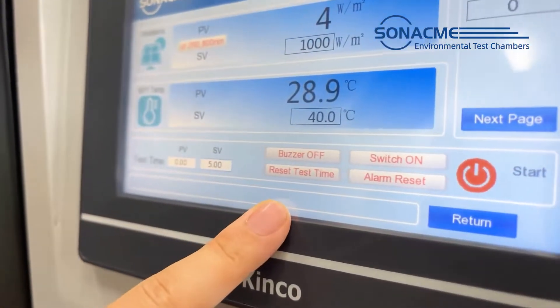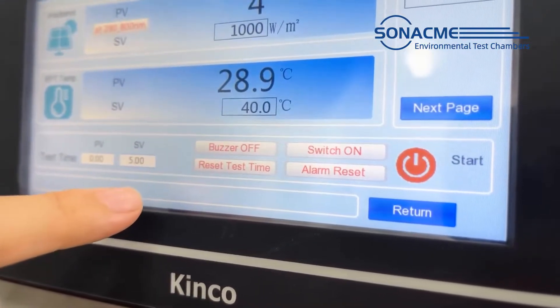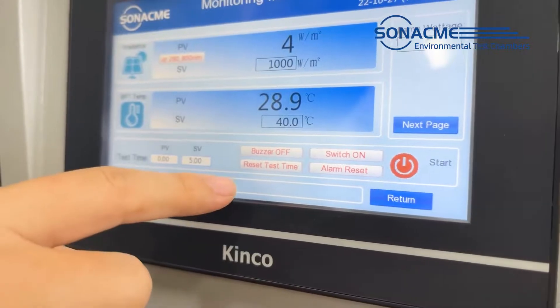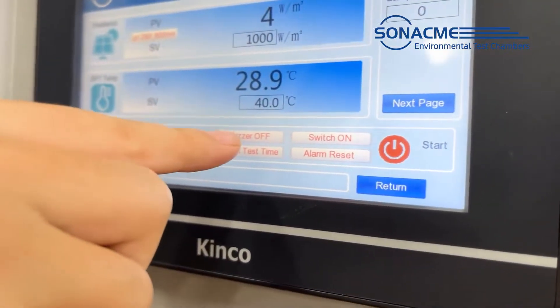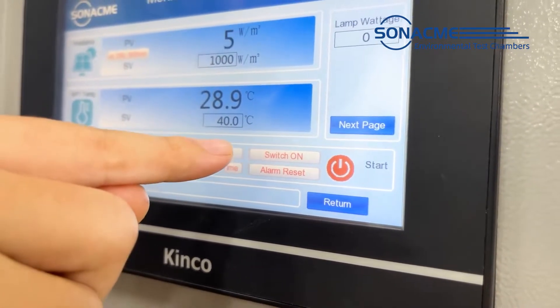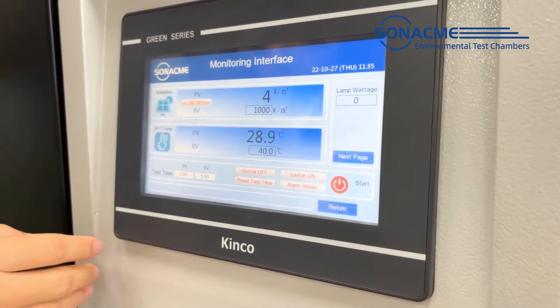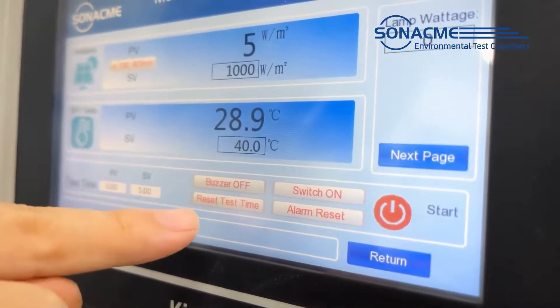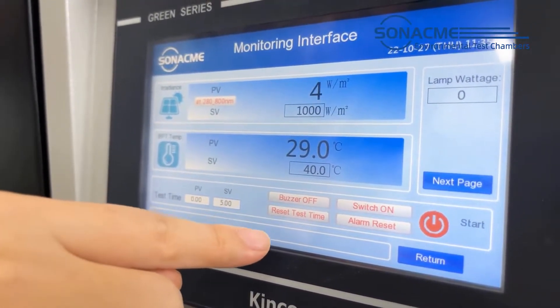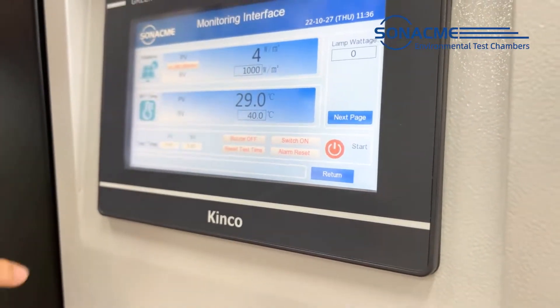At the bottom we can see 4 small buttons: buzzer off, switch on, reset, and test time and alarm reset. The buzzer off means during operation, if the chamber gets any failure or fault, it will buzz while running to notify the operator — click buzzer off to stop it. The switch on is a door limitation switch for operator protection; if the door is not properly closed and you click start, it will make noise to notify the operator. Reset test time means after one test finishes, we need to re-input our test requirements and start again. The alarm reset means after clearing all the buzzer alerts, we need to reset so it will trigger and work again.